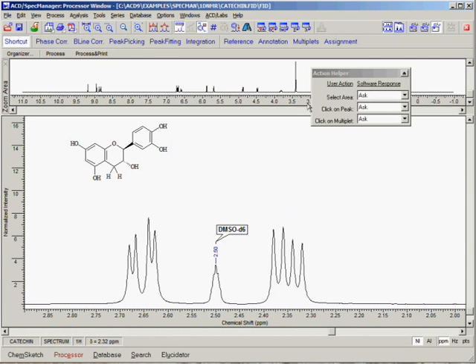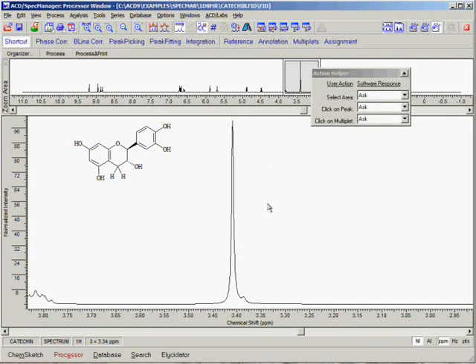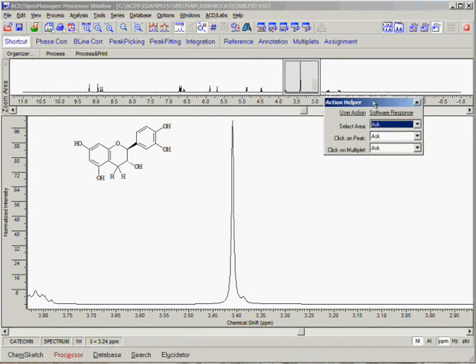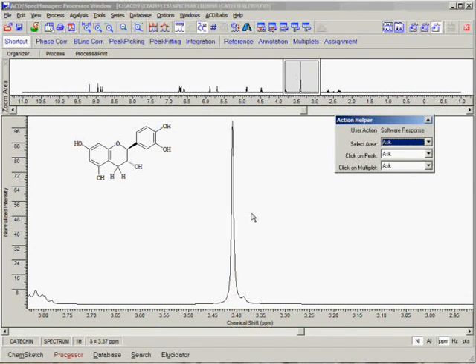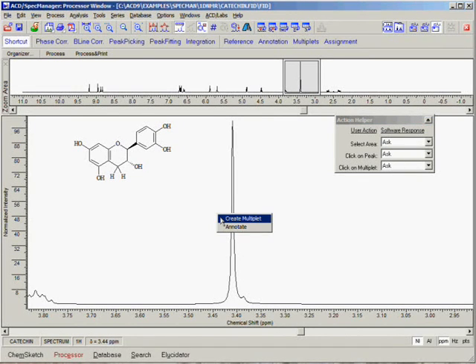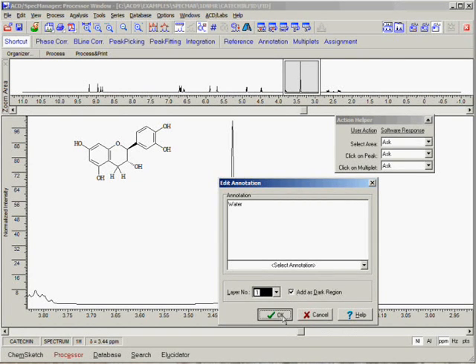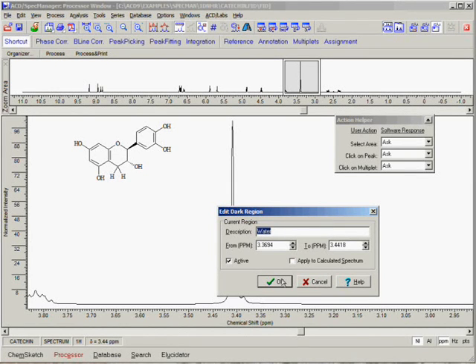In this spectrum, there is a rather large water peak that is not relevant to the characterization of this compound. We should remove this peak from consideration and avoid possible confusion later by clicking and dragging across the peak with the left mouse button. This time we are given the option to either create a multiplet or annotate the peak. We choose Annotate and the Edit Annotation dialog box appears. Here we can type the name of our impurity. Finally, we select the option to add as a dark region. By selecting this option, this region of the spectrum will be excluded from any other processing steps we perform in this session.